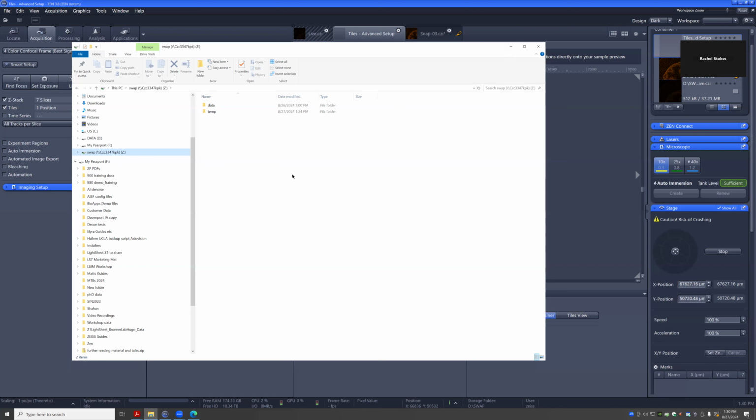But if you're just moving data, it's also possible, you can just drop it in that folder. I would recommend, I was testing if this worked, but you can make your own folders in here for storing data. I think the other computer also has a lot more space than this acquisition PC. You generally want to avoid letting especially this PC get too full with a lot of data, because then it's going to slow down.